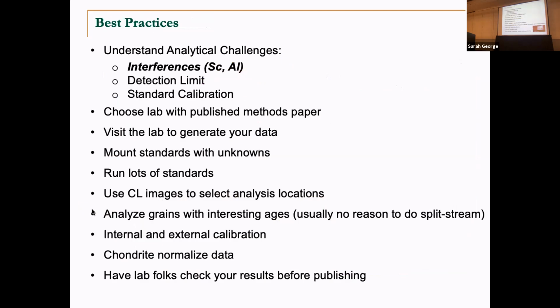Okay, so we need to understand the analytical challenges. There are analytical challenges here. We have clear interferences with scandium and aluminum. This is on laser ablation systems. So, you know, 2 of the studies were dependent on those 2 things, so be careful. We need to understand detection limits and standards. As always, run lots of standards, go to a lab that has methods papers, use CL images, analyze grains with interesting ages, normalize your data, all the things that we've heard before. Treat your data well. Okay, that's all I've got.